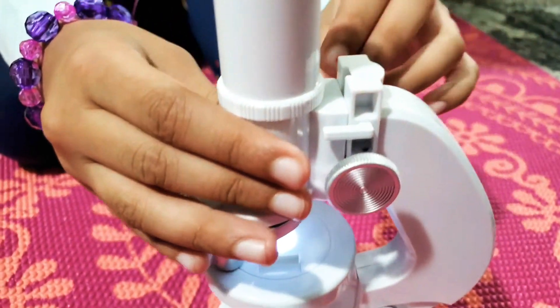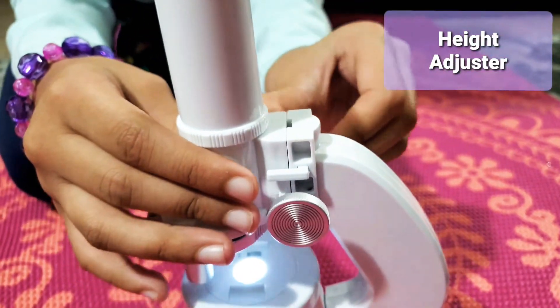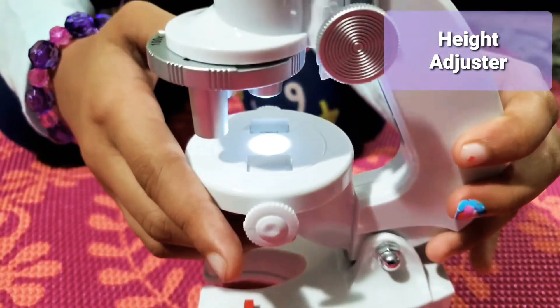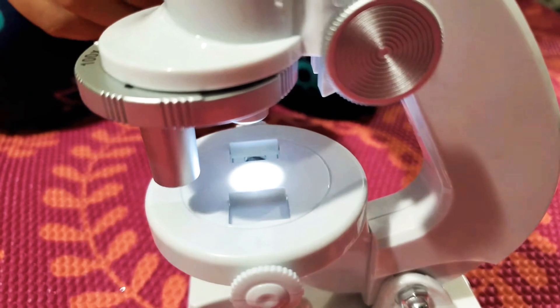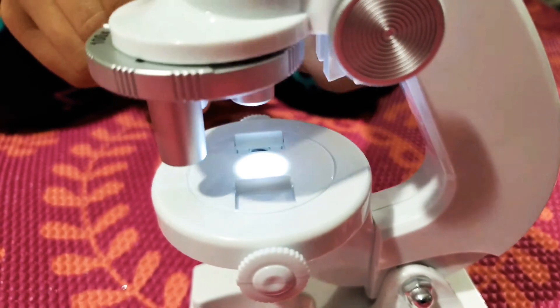Here we have a height adjuster — it can go up and down. There is an LED light in here. Let's put this back down — it can go up and down.